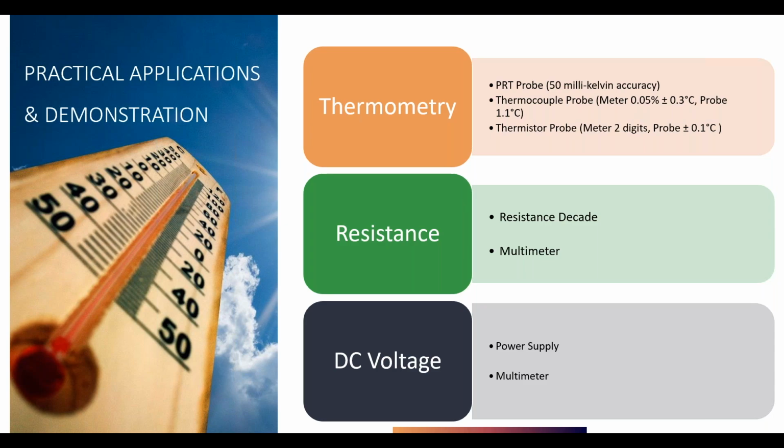So yes, you can build up thermal layers within even that mug of ice water. For the normal person, if you put a liquid in glass thermometer in there, it would probably read, or look to read, pretty on the dot. But when you start plugging in a PRT type probe that's reading in the 2 or 3 decimal range, it becomes very apparent that there are various thermal layers even in that ice bath. When you stir it, it now becomes a much more constant temperature throughout.